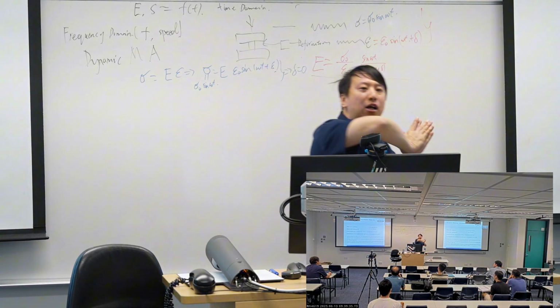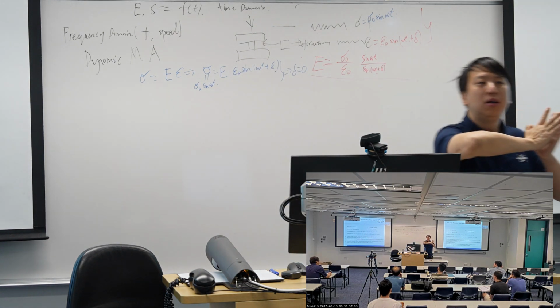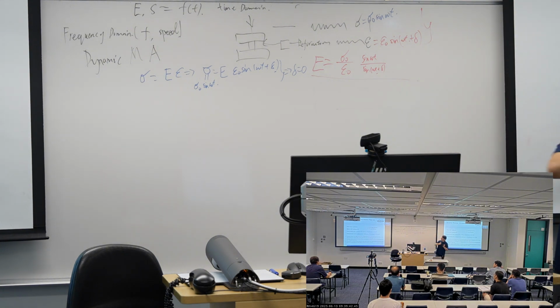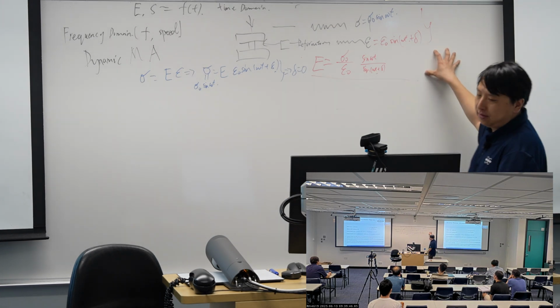And so for the pure elastic, the sigma and the epsilon are in phase. When I apply larger force, my deformation will be larger. When I apply small force, the deformation should be small. So it is completely in phase.